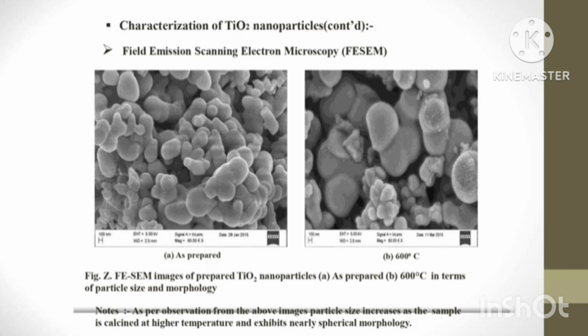As we scan any document, likewise we scan our prepared particles in this FESEM. You have that equipment, we take the slot, go, and put the sample in the sampler.